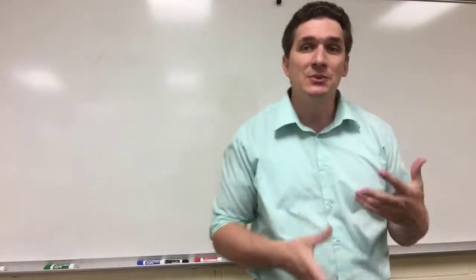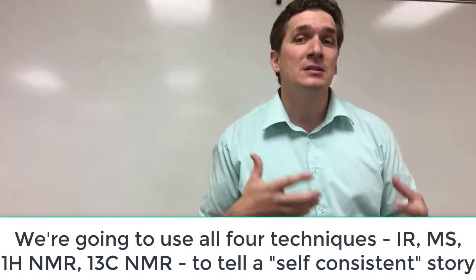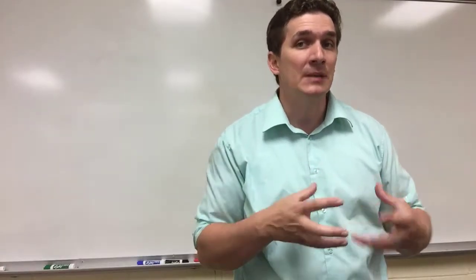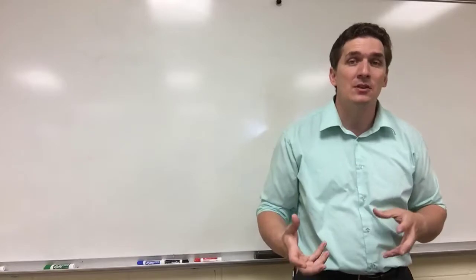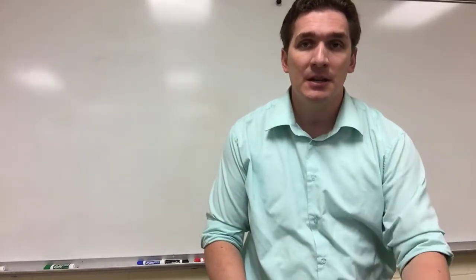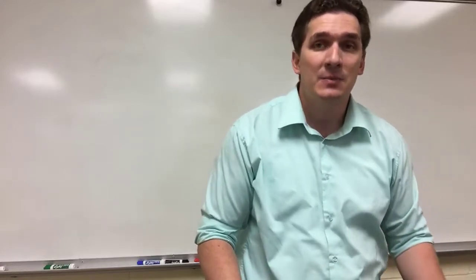We're going to see fragments, and we expect them to be associated with a functional group. Our IR is going to tell us that those functional groups are there. So what we should see is a mass difference, or at least a mass corresponding to whatever functional groups are being observed in the IR. If you're seeing OH groups and alcohols in the IR, you think they're there, you should see a similar chemical shift in the NMR, as well as a similar fragment in the mass spec.